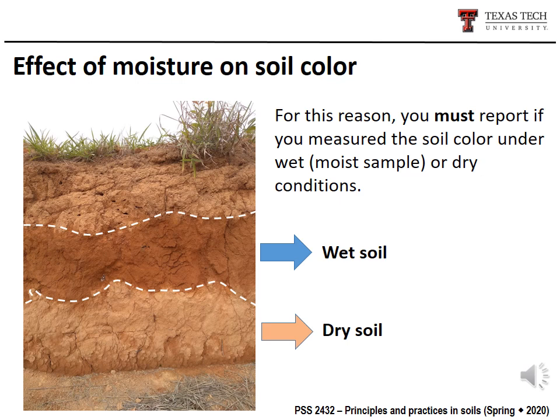Basically, when we measure the soil color in the field, I can do this using a wet sample or a dry sample. And we must report this. Okay? The soil moisture has a great influence on soil color.